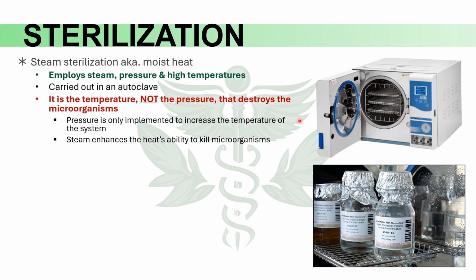But what about the steam? The steam enhances the heat's ability to kill microorganisms. Whoa. What does that mean? Well, steam is an excellent medium for transferring heat as it can easily penetrate and evenly distribute heat to all parts of the product being sterilized. Once steam condenses on the container, the thermal energy transferred to the product will kill the microorganism. As such, this is the method of choice for sterilizing parenterals if the product can withstand it, meaning that if the product is not susceptible to breakdown by moisture or heat, steam sterilization is the most commonly used method.